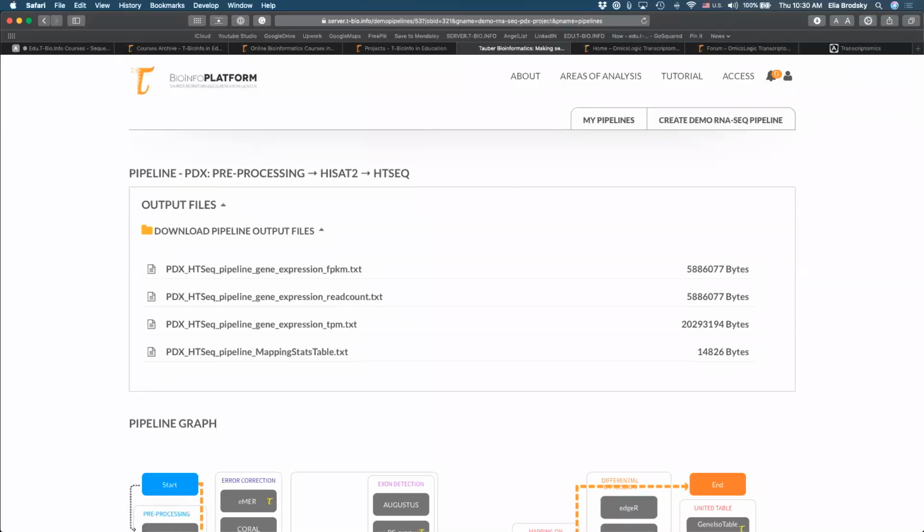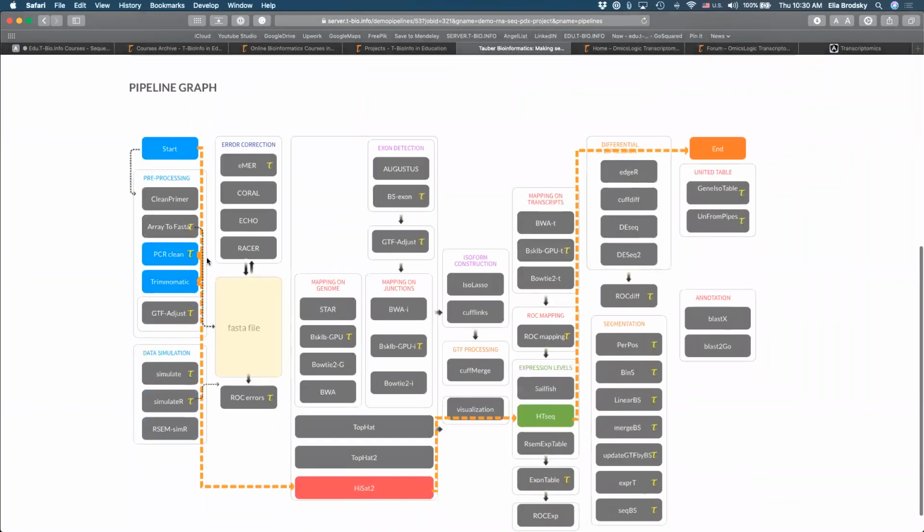Okay, what is the RNA-seq pipeline? So what you're looking at now is the RNA-seq pipeline. A pipeline means that data from a script or a job has been submitted to the next script, and in a sequential manner, the pipeline produces outputs that are used by the next consecutive method to give you the final output. So this is called a pipeline.